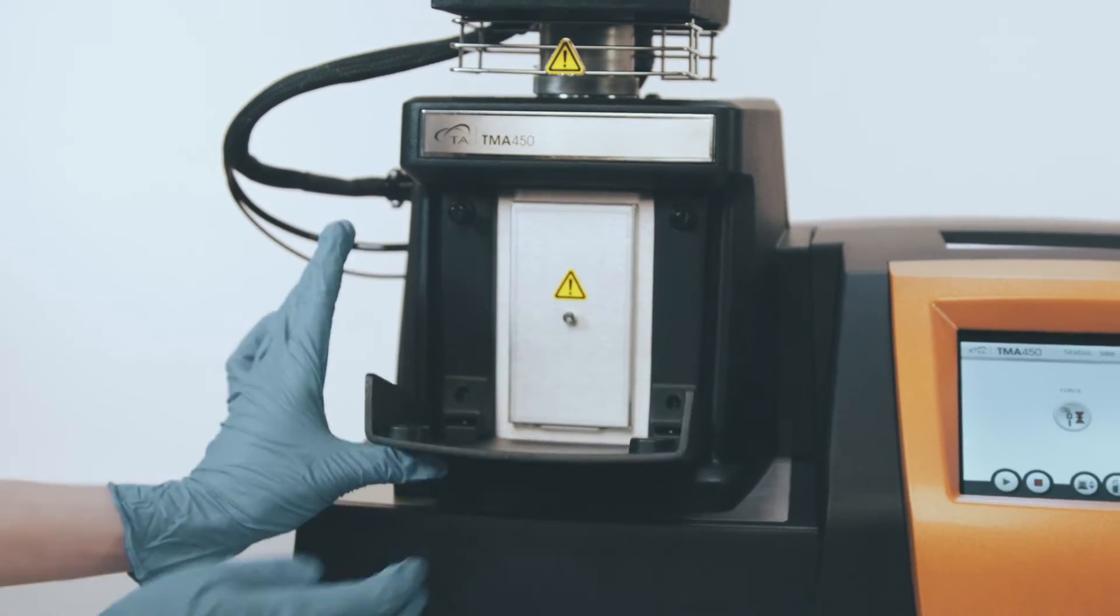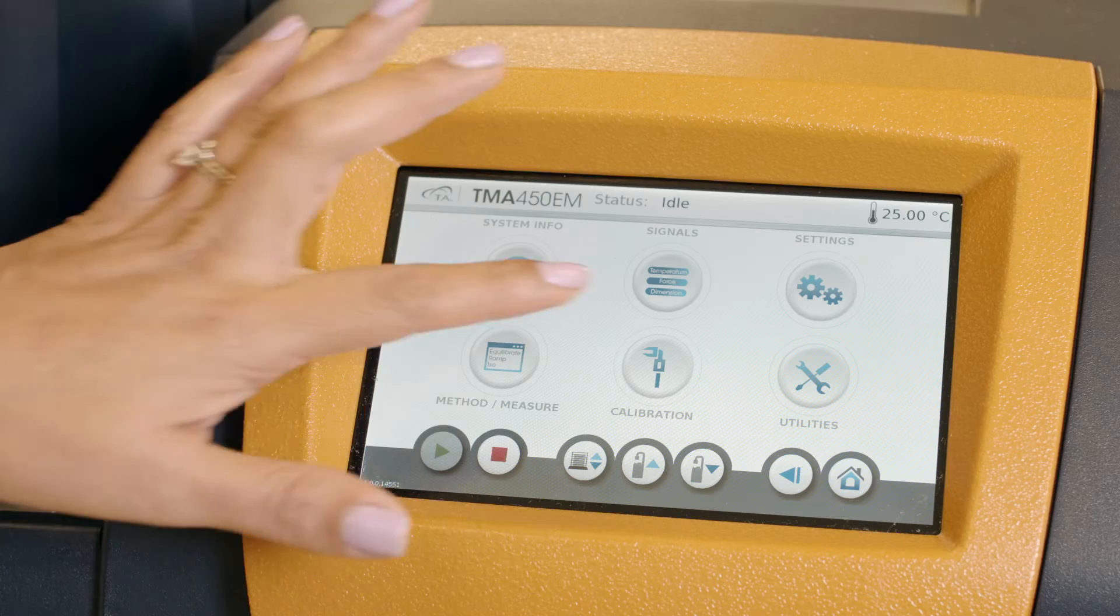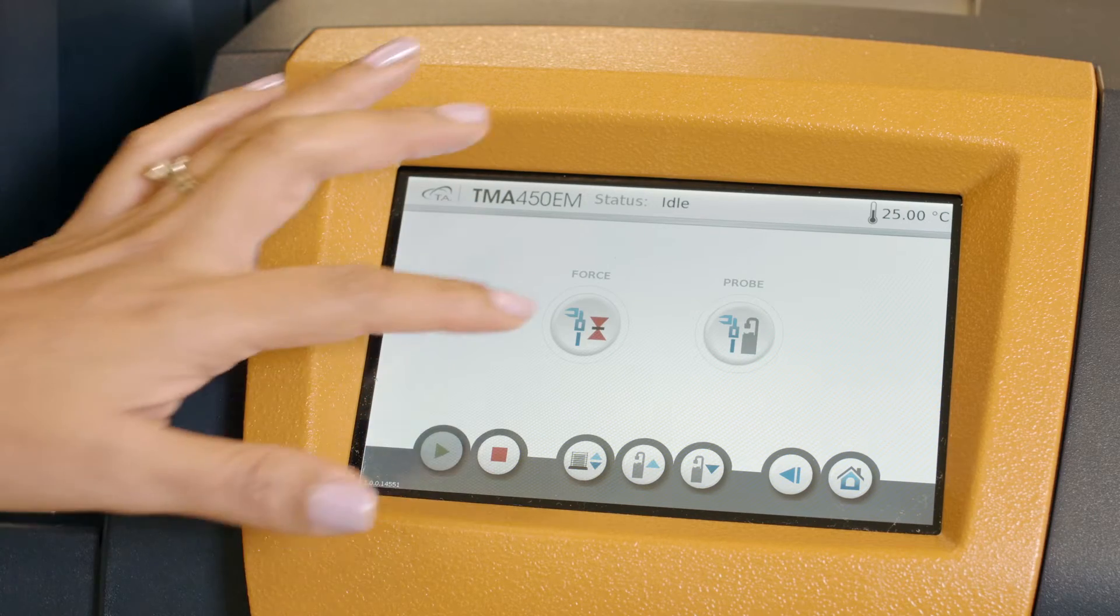You can calibrate force from the instrument touch screen by selecting calibration, force.